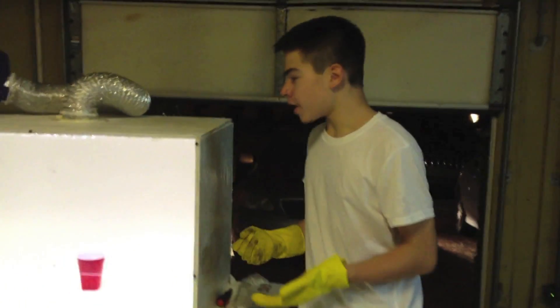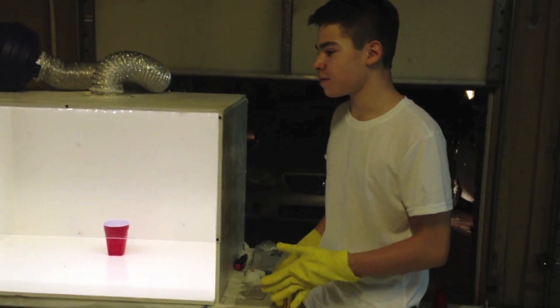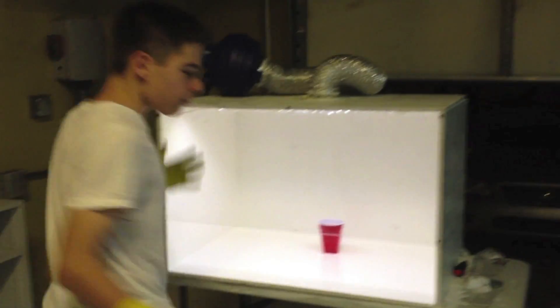So I know what you're saying — Steven, why can't you just do your experiments at FIU? And it's because they don't allow it, and the lab space is only for research activity. So in order to prevent that, we've built a fume hood here.